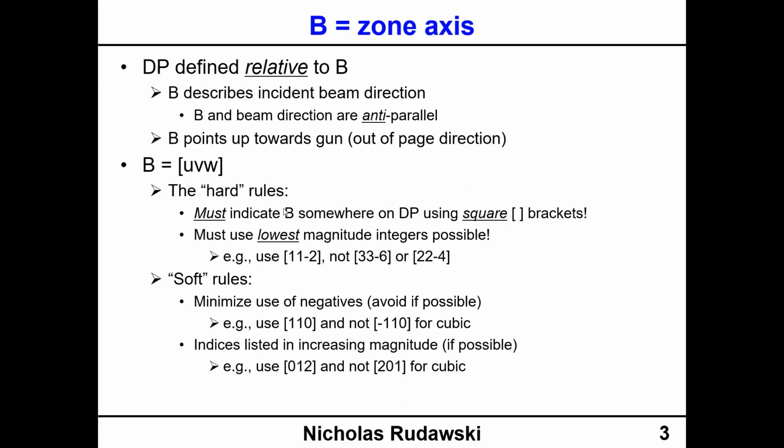So that's all we have to do to compute the G vector length for a cubic crystal. And again, you don't see a lattice constant here because this is a relative G vector length, okay? So the lattice constant is irrelevant, okay? All we need to know are the indices, okay?